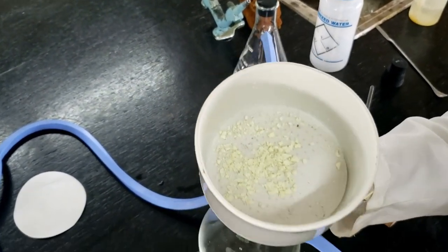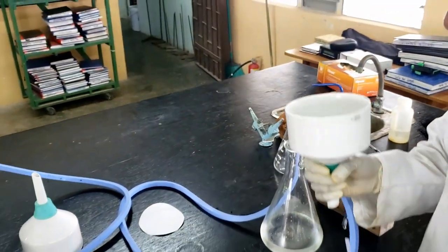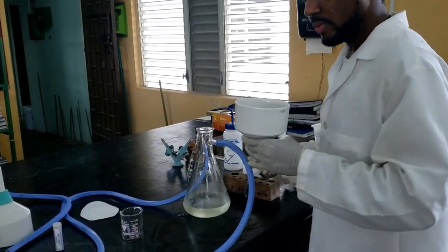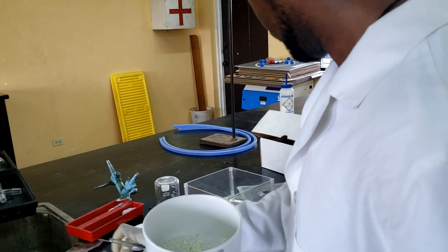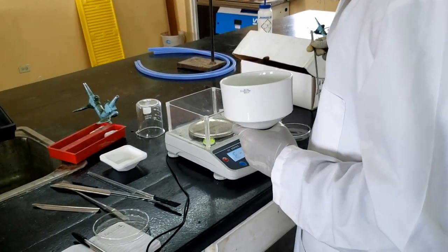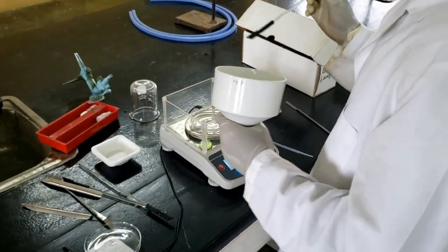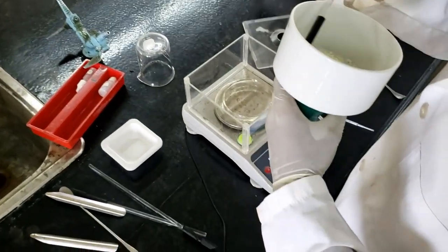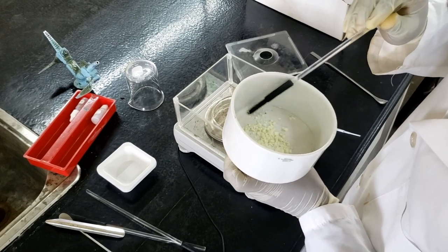Okay, so we've dried the crystals a bit under vacuum filtration. Now we're gonna go and weigh the crystals. We want to make sure we get an accurate mass of the crystals so we can move on to the next part. So I'll move over to the scale. I've already pre-weighed the petri dish. So I'll just try to get the filter paper up and transfer all the crystals onto the petri dish.